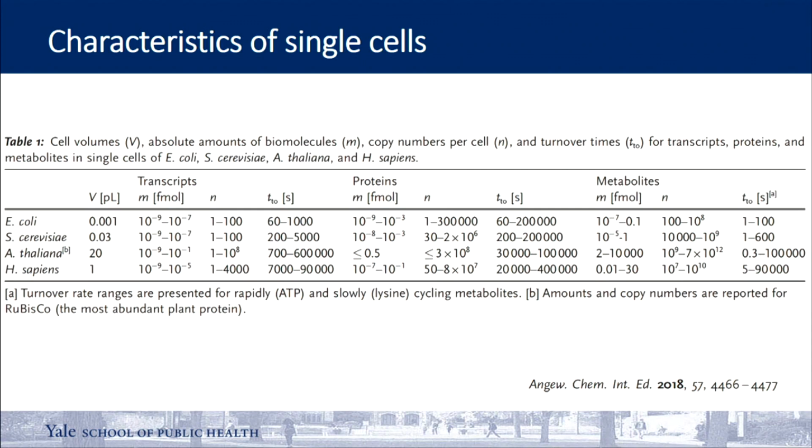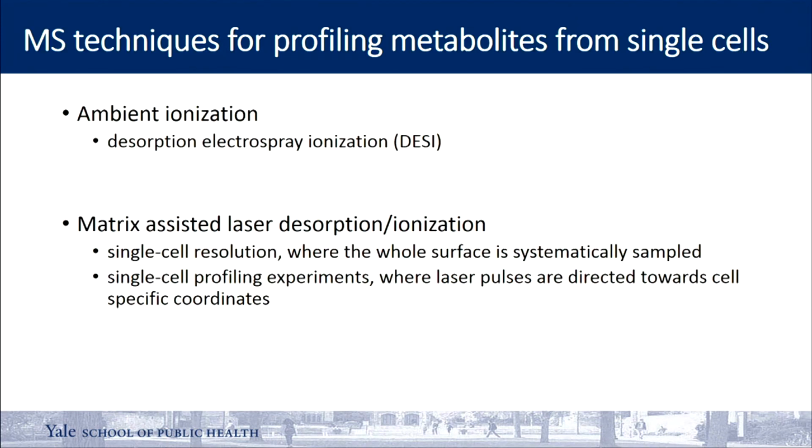Another thing which is really important is the turnover. When you're talking about single cell metabolism, it is the turnover and how fast it is, and what conditions you are examining, especially when you want to look at the influence of environmental factors and chemicals on the cells. So you have to really quench the metabolism, you have to stop the metabolism to get meaningful data, because once you start processing it, all these enzymes are still working and changing your phenotype.